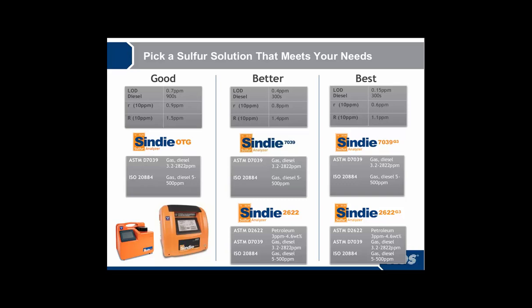One of the questions here is, is there any difference between vacuum mode and helium mode regarding the results? And this would be on a Sindie 2622 analyzer because we offer them both in vacuum mode and helium mode. And actually, there should be no difference. We actually don't use a lot of helium. The analyzer is still under a slight vacuum with helium trickling in, and we're not using enough helium that it would make a difference.